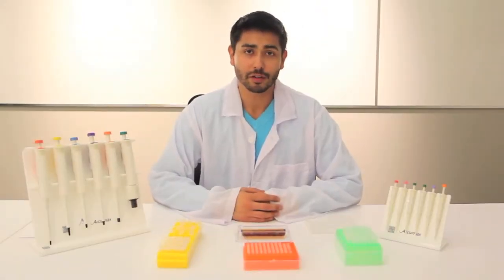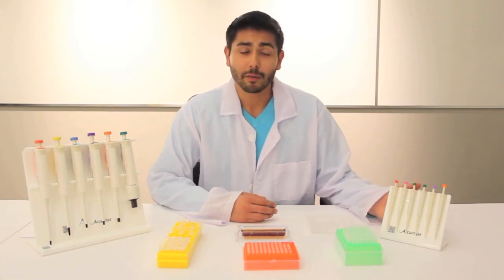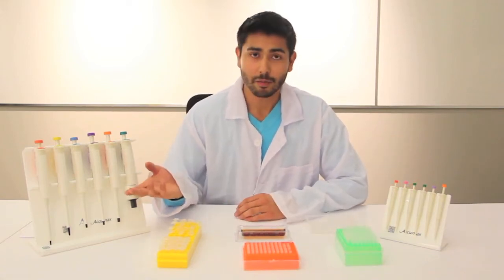Hello and welcome to the Real World Education AcuMax Junior Pipette Tutorial Video presented to you by Quasar Instruments. Today I'll be walking you through the uses of the AcuMax Junior Pipette, which you see on my left, and comparing them to more traditional pipettes such as the AcuMax Pro, shown here on my right.